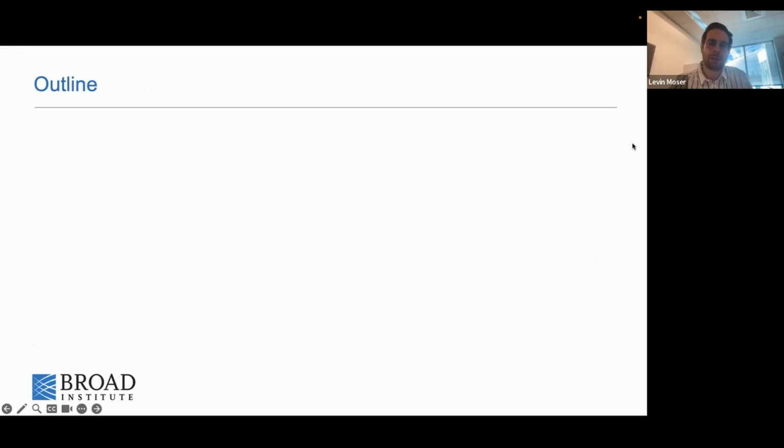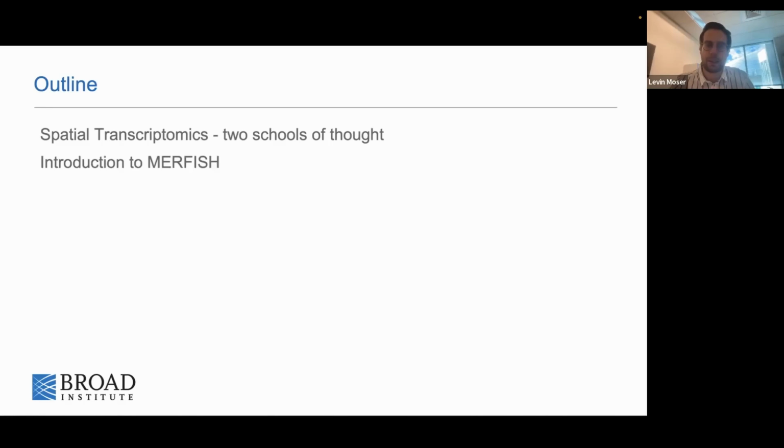But before we start with that, I just want to give 15 minutes of a presentation about spatial transcriptomics and MERFISH in general, specifically MERFISH, because that's what we're going to use today. By the way, if you're not using MERFISH but something more like 10x Visium, it's not that different from an analysis point of view.